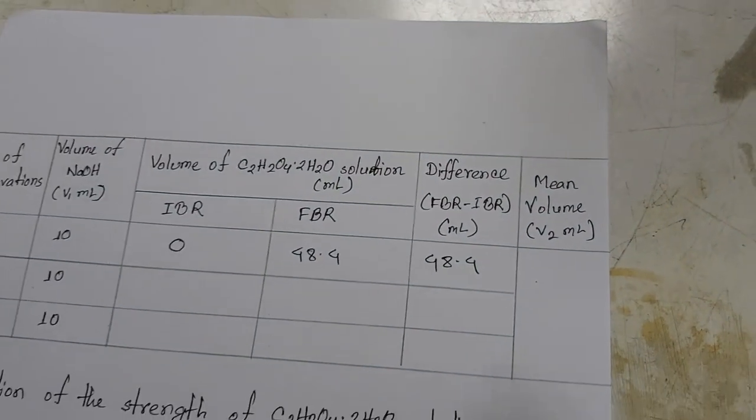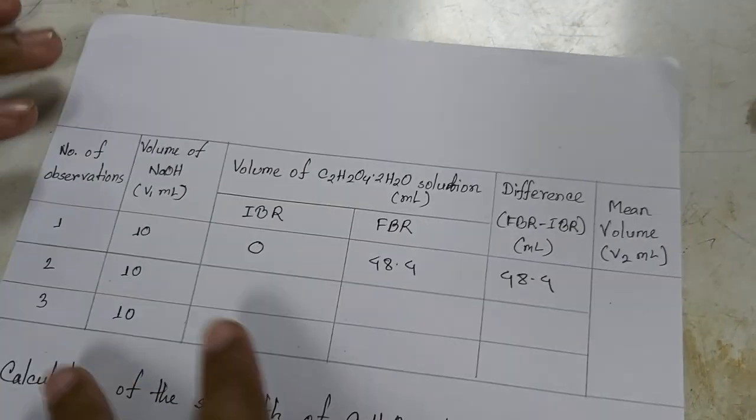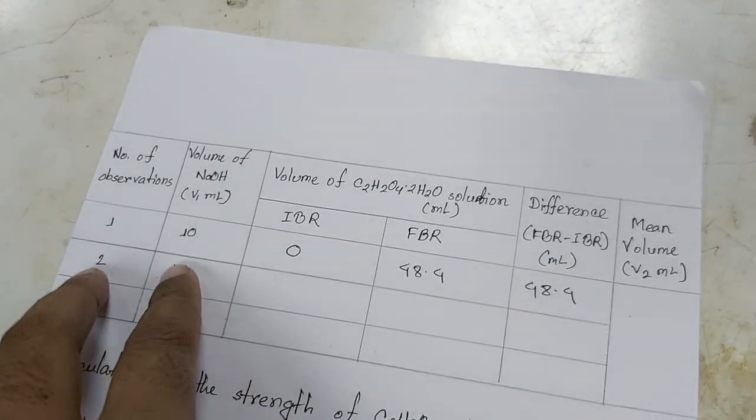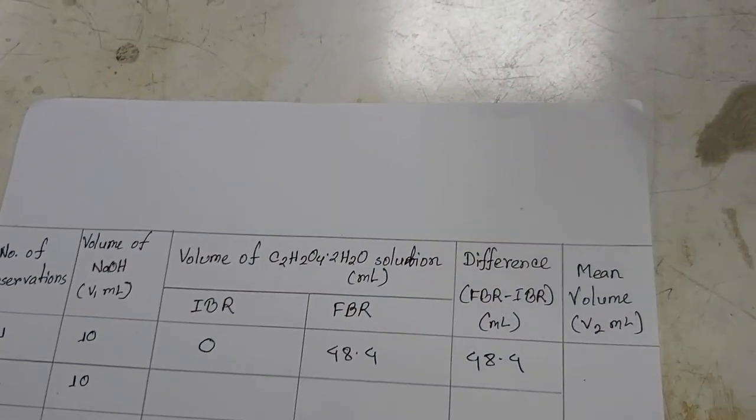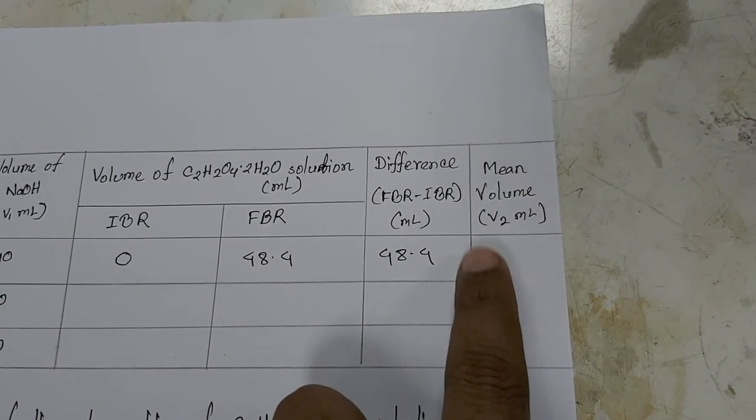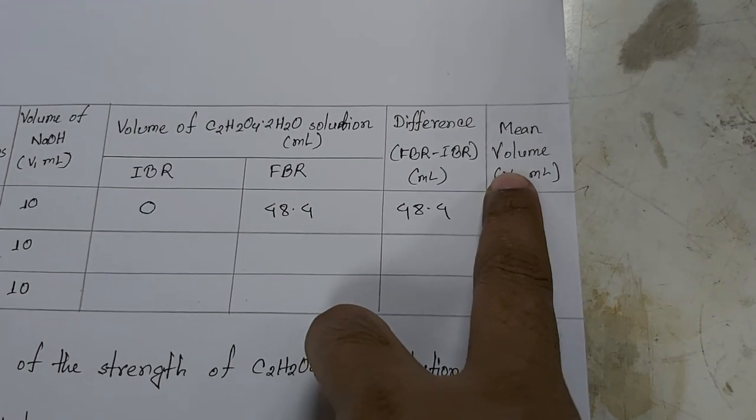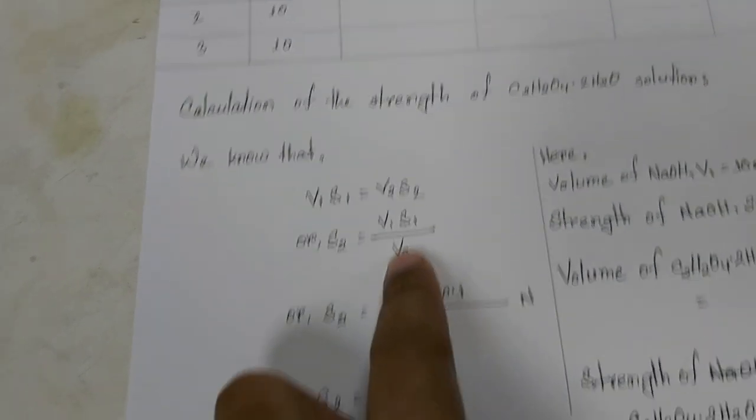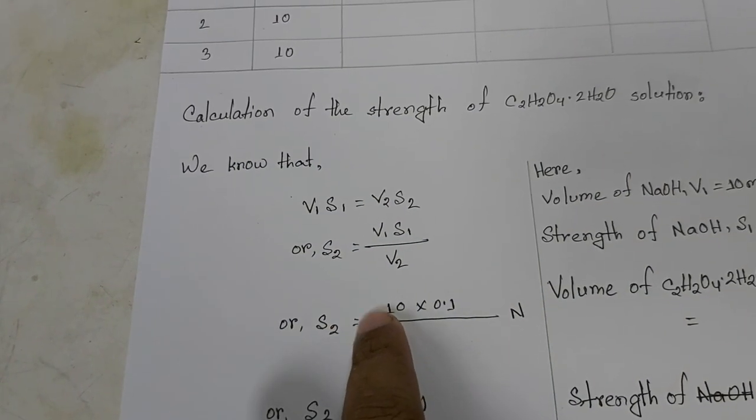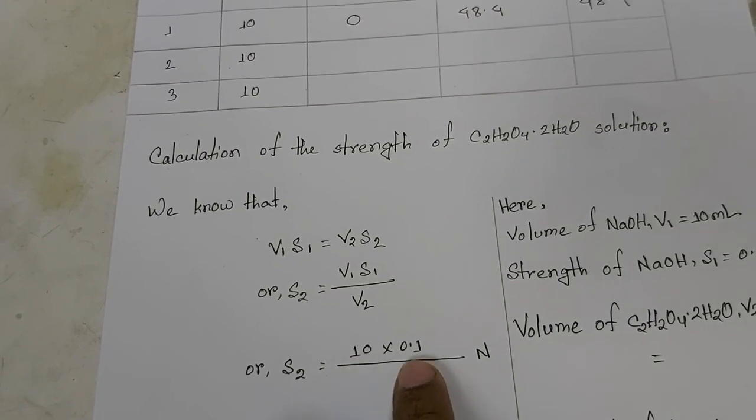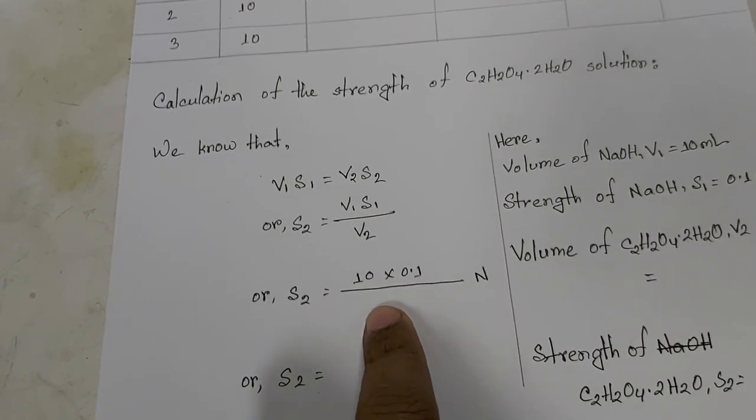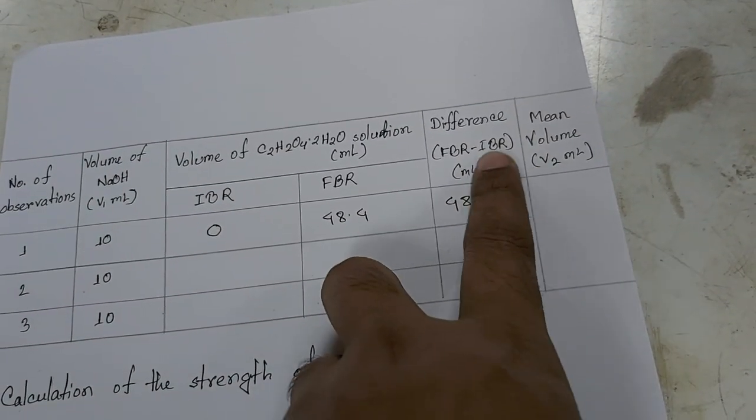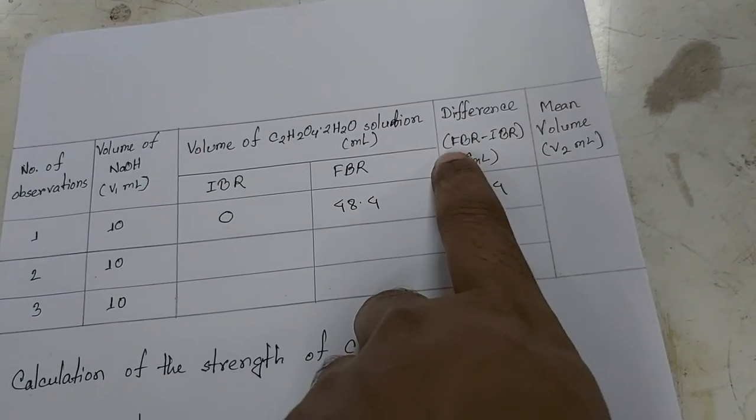We have to perform at least two more titrations. After completing three titrations, there will be a mean, and this mean value will be V2. By using the equation V1S1 = V2S2, we know that the volume of sodium hydroxide taken was 10 ml, and its concentration was 0.1 normal.